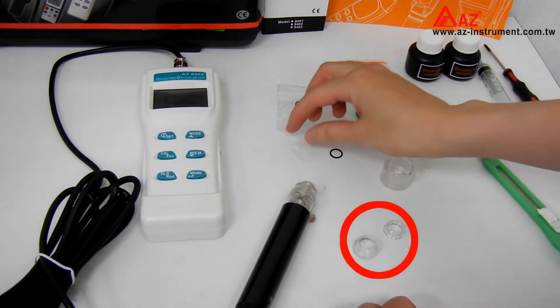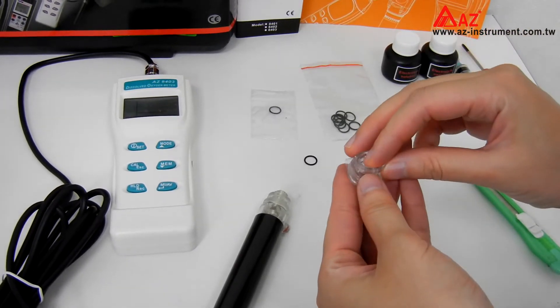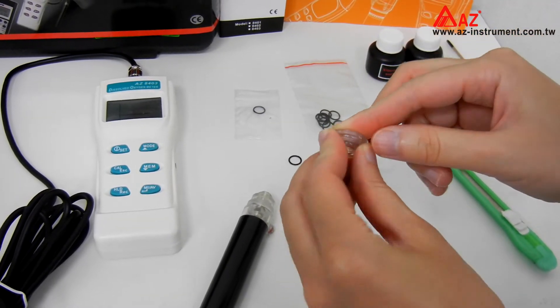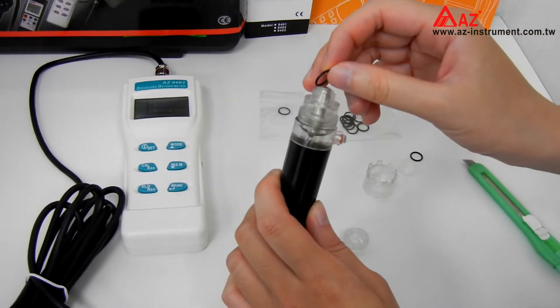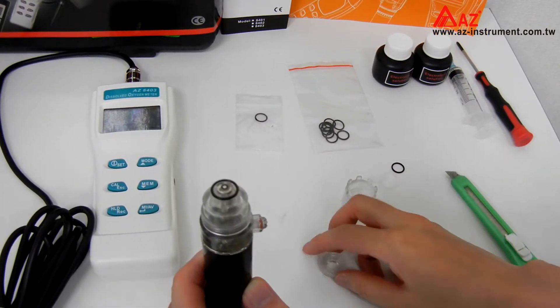Put the new membrane on the lock ring and cover with a pad. Install the new O-ring on the top of the sensor. Make sure the O-ring fits flat. Then put on the cap with the new membrane.